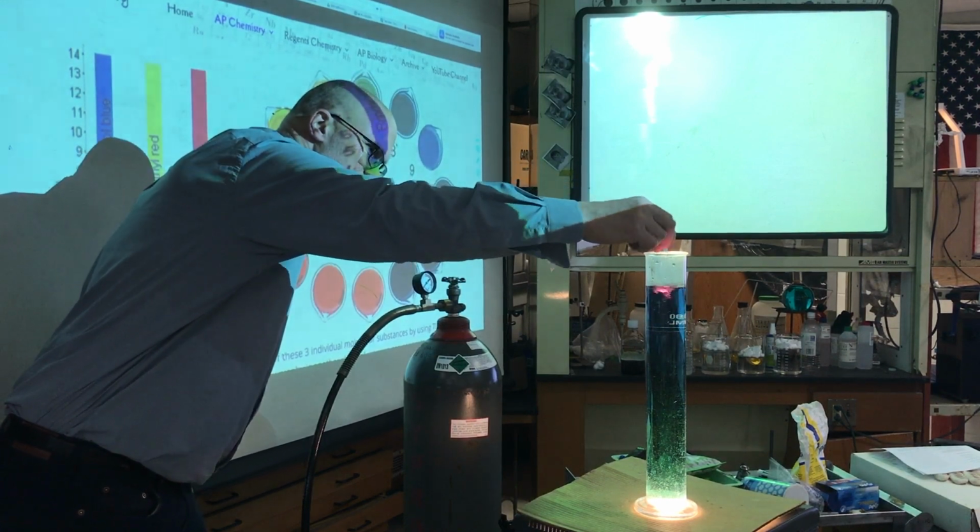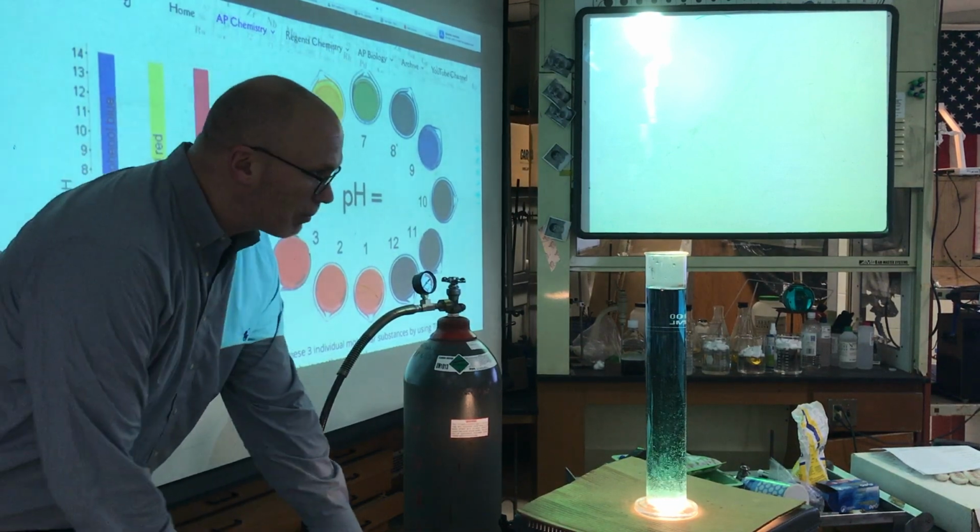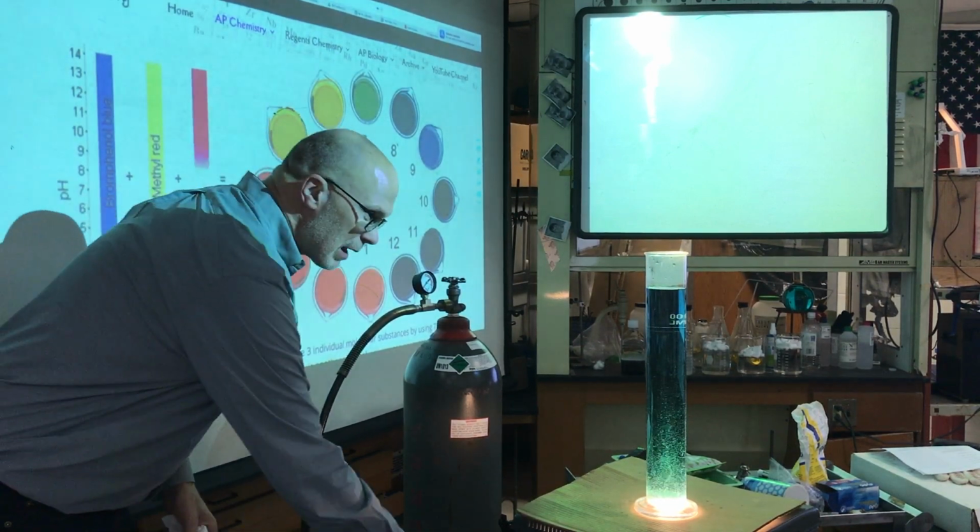As you can see, the color change occurs. A little bit green on the bottom, but that's cool. Now, I got a little bit more basic on top, and I can add some more if I'd like, but I think I like that.